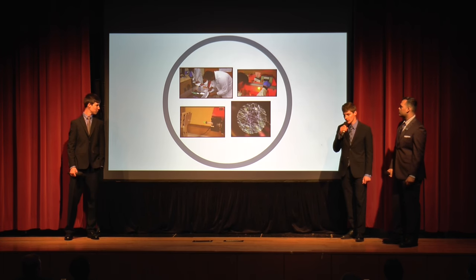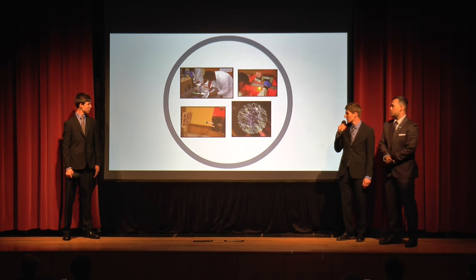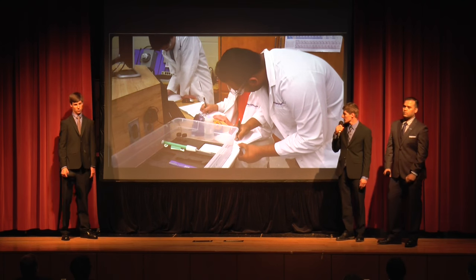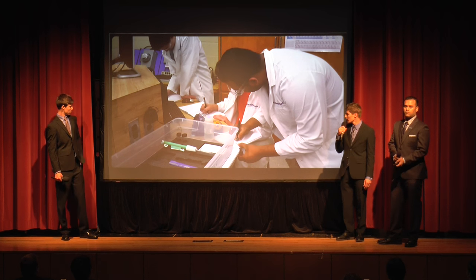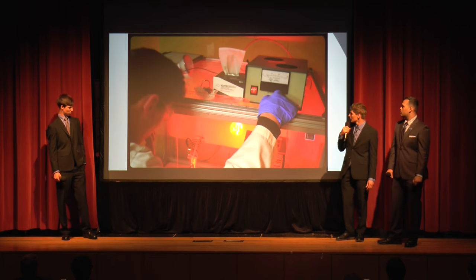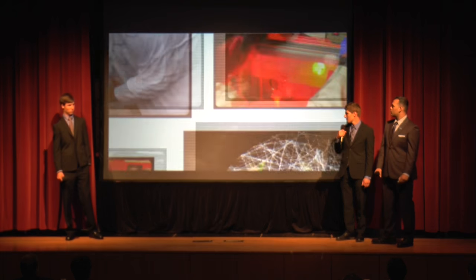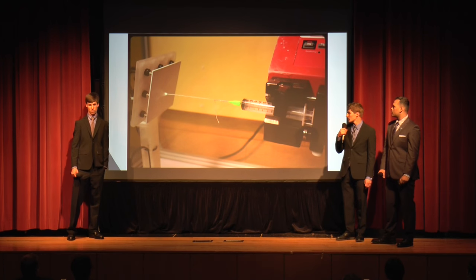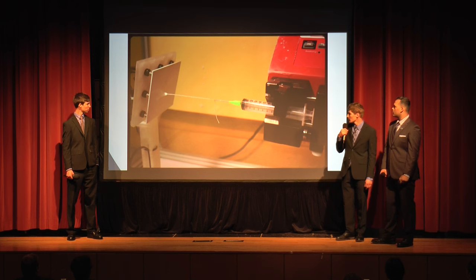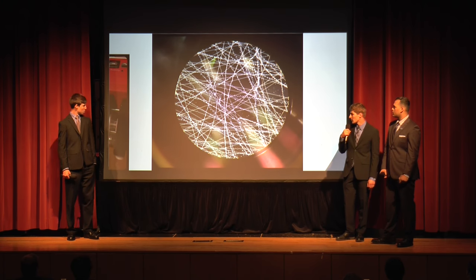Our purpose for research this year was to discover a soundproof nanofiber, and we wanted to test the properties of electrospun nanofibers. Right here, we have a picture of us doing the calculations to create a PCL 20% 80,000 molecular weight nanofiber. Right here, we are adjusting the voltage to use the electrospin station. Then here is a picture of the actual sample, and we actually have a beaded stream back to the syringe pump. And here is the same image of that same polymer solution under the Zeiss microscope.